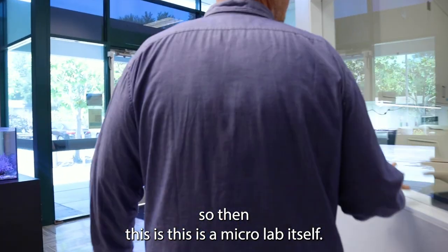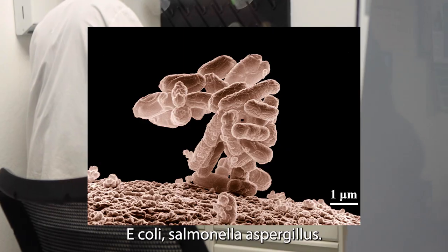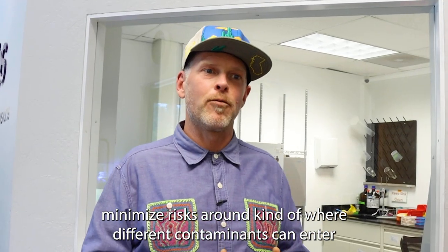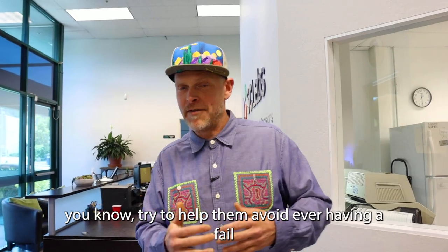This is the micro lab itself. We test for total yeast and mold levels, total aerobic bacteria levels, E. coli, salmonella, and aspergillus. We also work with folks to help minimize risks around where different contaminants can enter their supply chain and try to help them avoid ever having a fail.